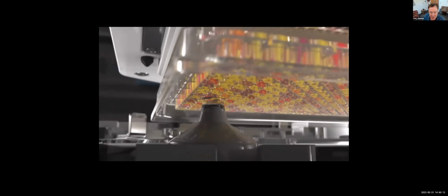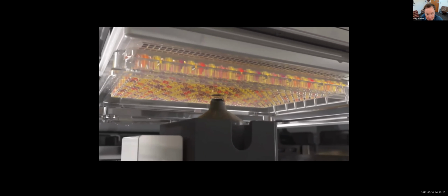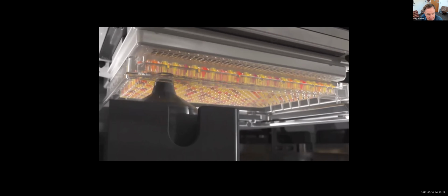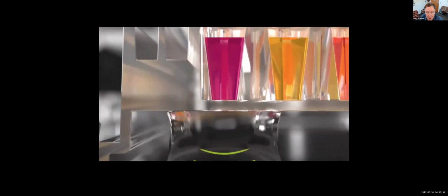And then finally, I'll just end with this movie, because people often ask how we've dealt with so many molecules when generating this data. One of the key technologies that's really facilitated this has been acoustic deposition. I think it's a Labcyte acoustic deposition device. It allows us to deposit nanoliter sized droplets from our wells onto our plates, and you can shoot as many droplets as you like onto this.